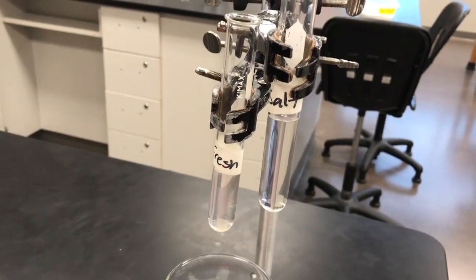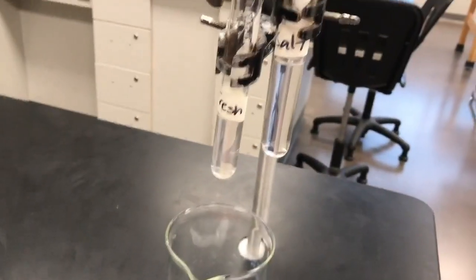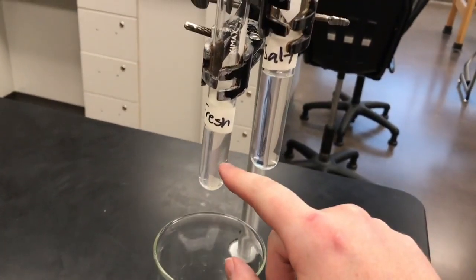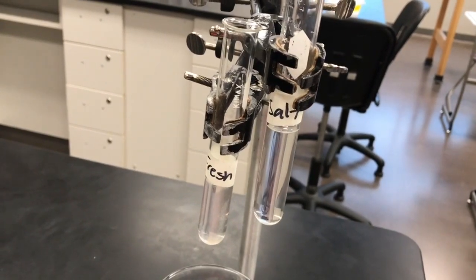Okay, before we start any of the procedure, this is the very first thing you're going to do. Make sure that your test tubes are filled up. You've got one with about a quarter of the test tube filled with fresh water, and one with about a quarter of the test tube filled with salt water.